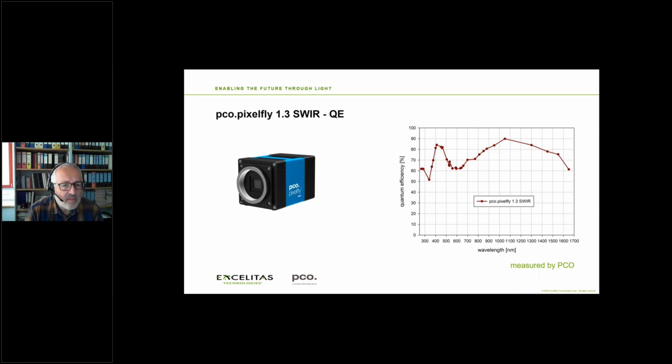But, and this is something that I have to emphasize, if you use, for example, scientific CMOS cameras and sensors in microscopy applications, then the readout noise features of an InGaAs sensor are a lot different. In the CMOS world you are comparing 1.3 to 1.8 electrons, or 0.8 or 0.5 electrons readout noise, while in the InGaAs world we are talking about 180 to 200 electrons. That's a lot more, which means for a proper image you need a lot more light.